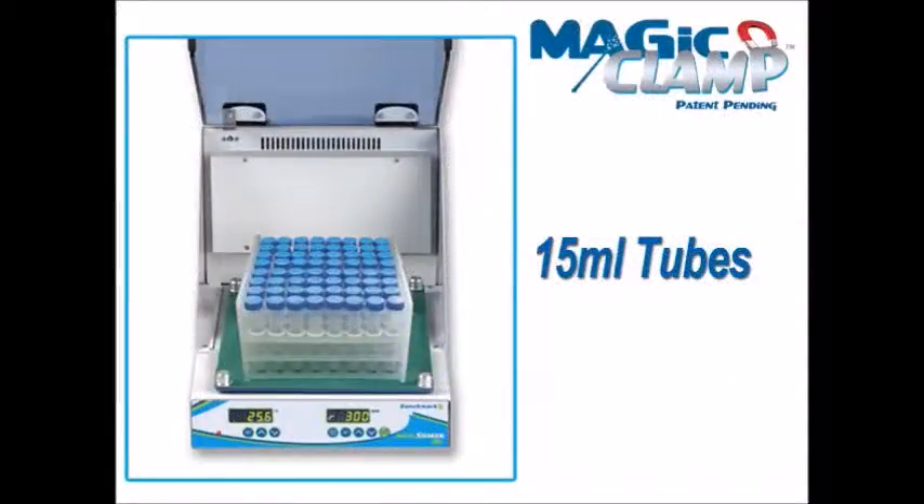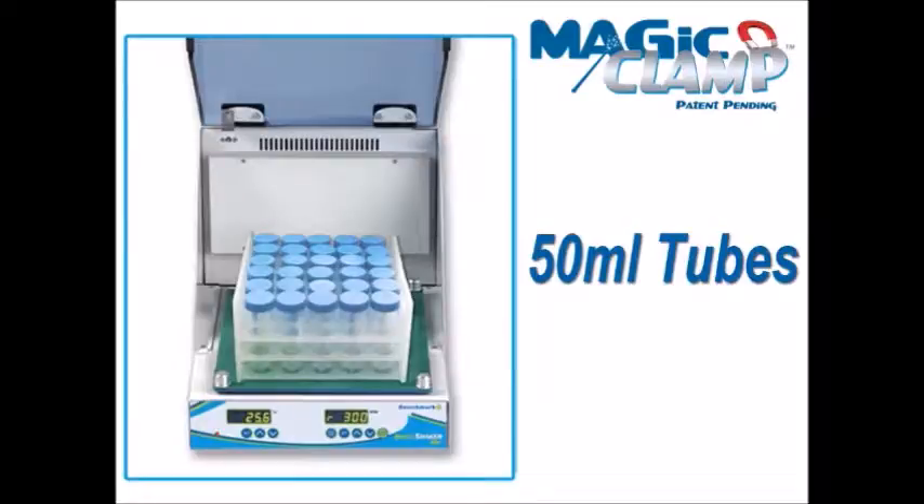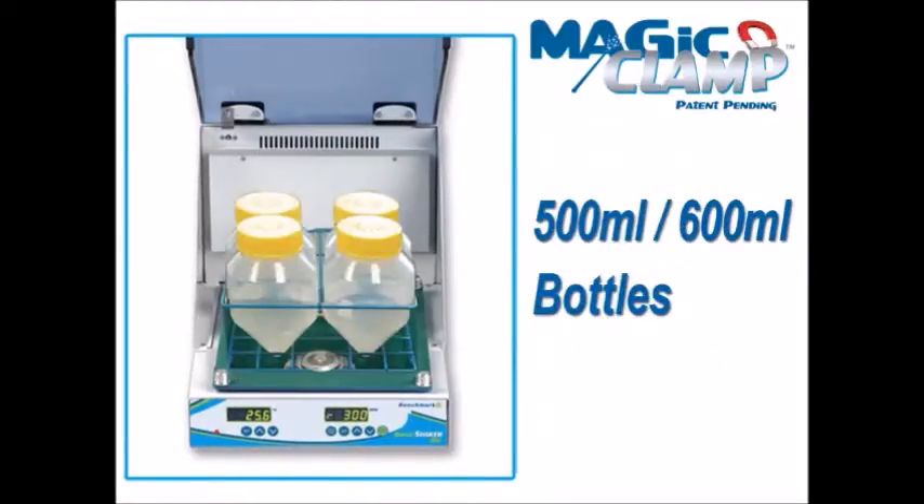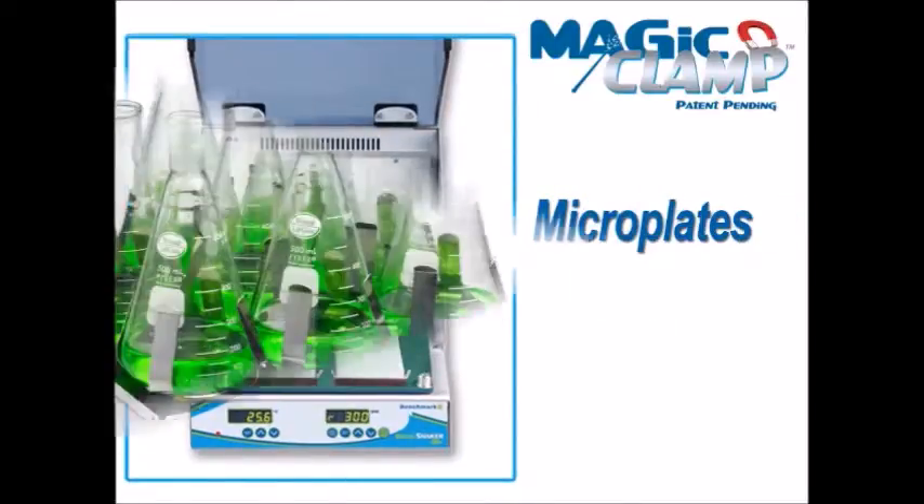In addition to convenience, the Magic Clamp system also adds versatility. While many traditional platforms are only designed to hold flasks, the Magic Clamp platform holds a variety of racks for tubes, bottles, and plates.